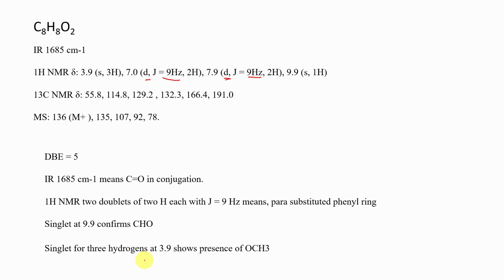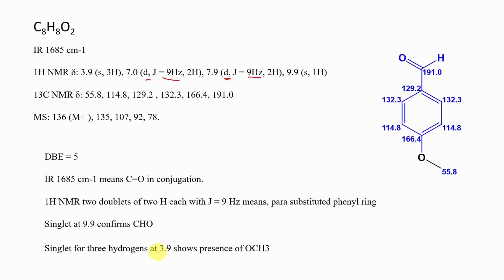By considering all these data, we can assign the structure for this molecule as like this. It is para-methoxy benzaldehyde.